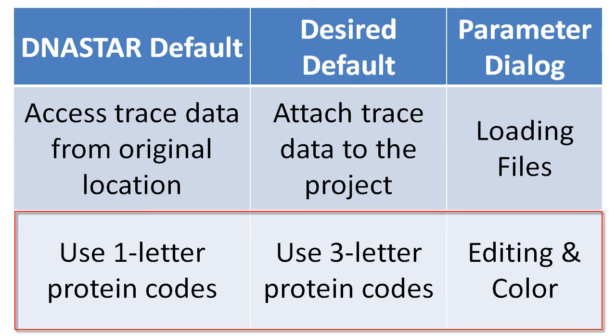The second parameter we'll change is how protein codes are displayed. SeqMan Pro normally displays them as single-letter codes, but we want to see three-letter codes in our future projects.